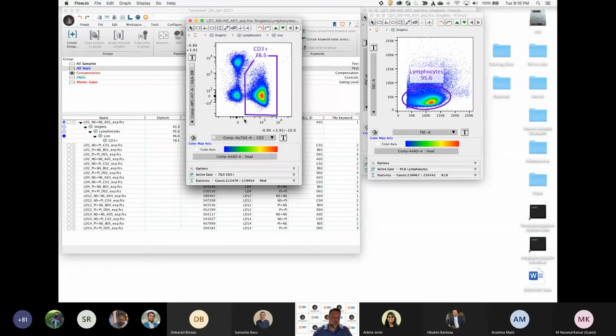We're actually looking at data by default on a bi-exponential transform function, and bi-x means that there's a linear range around 0 that displays all the low-end events, so you can see the negatives and any negative events within this plot. And then there's a log range further out. So a linear range around 0, and then it turns into a log scale so we can see the 10 or 100 or 1,000 or 10,000-fold difference between a negative population and a population that expresses the antigen of interest. This bi-exponential scaling can be changed and modified to make your data look very different depending on your needs. It's just a visualization change. It's not actually changing the raw data.